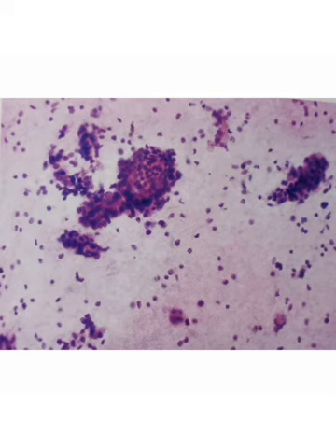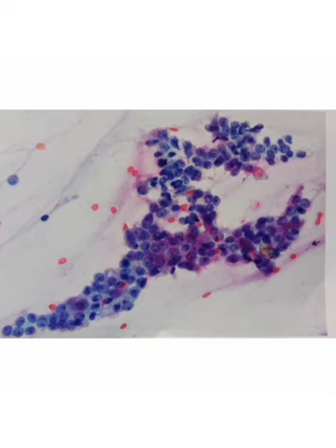This is also the characteristic finding to exclude malignancy of the breast. So bare nuclei in the background with clusters of benign duct epithelial cells is the finding of benign breast tissue, and with the type of cluster present here, the antler horn cluster, you can say this slide is definitely an FNAC of breast pathology, fibroadenoma. This is the high power view of a tightly cohesive cluster of benign breast duct epithelial cells with uniform nuclei.